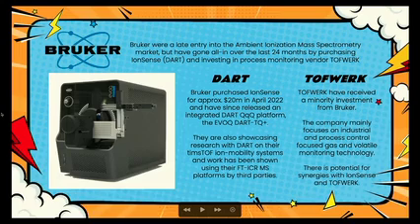Which brings me on to Bruker. And over the last couple of years after they bought out IonSense, they've done what those of us that have been doing ambient mass spectrometry for years and years and years have been begging people to do. They've properly integrated an ambient ionization source into an instrument. Whereas with things like the DART QDA, you have a separate bit of software to control the DART source, and then you've got the MassLynx software to control the QDA mass spectrometer. With Bruker, they now have an integrated solution where everything is controlled from the same software. And they brought that to market as the EVOQ DART TQ+.